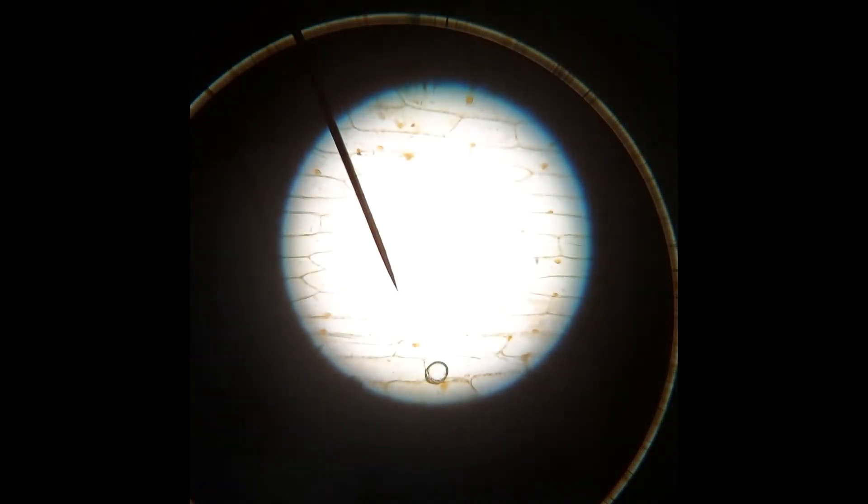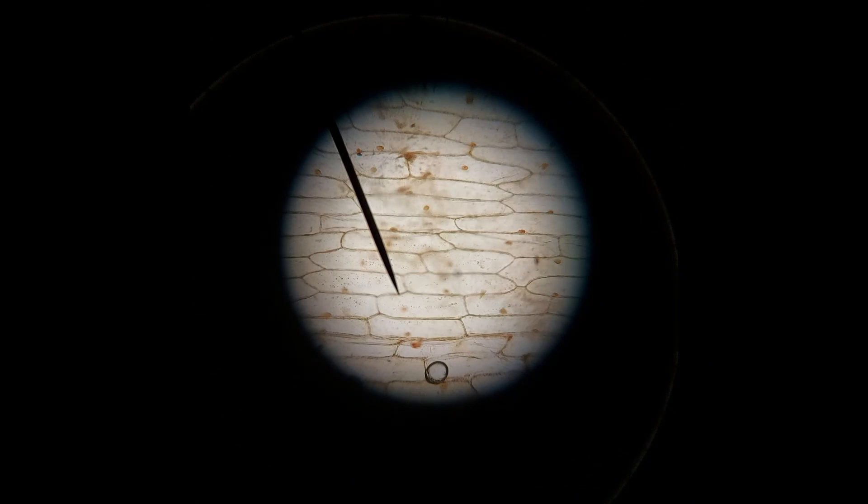Let me find one that's nice enough for us to draw. Actually, it's a bit too zoomed in with my phone camera. So I'm just going to go back to the 100 times magnified. And get you guys to draw something similar to that.